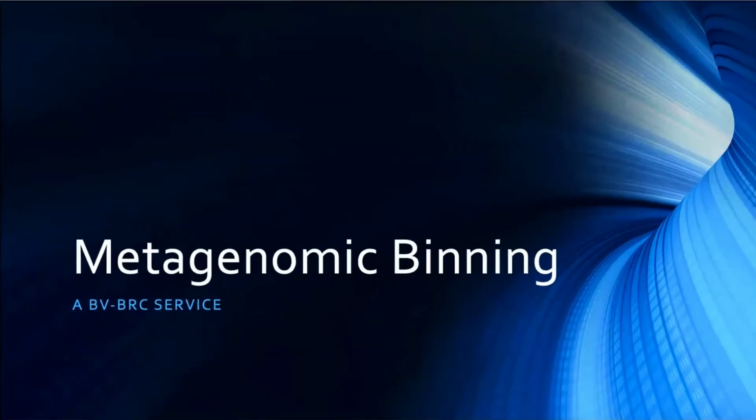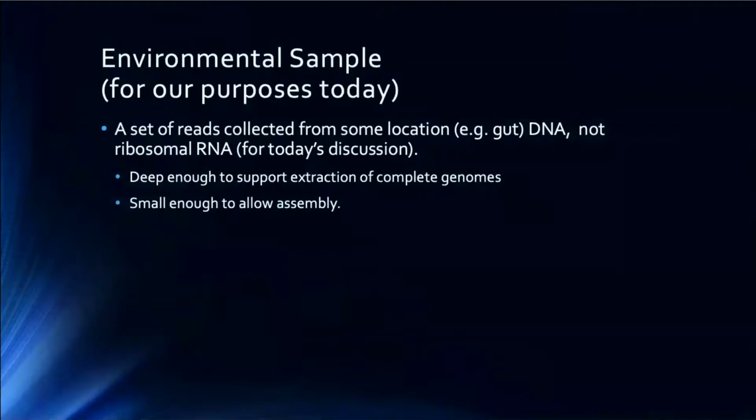All right, so we're going to talk about metagenomic binning, which is another service in BV-BRC. For the purpose of what we do with the binning in BV-BRC, it's been targeted at environmental samples, in large part because that's where the folks who are doing this, where their interests lay. And the intent initially for this service was to use environmental samples to extend the set of genomes that we know about by extracting high quality, fairly complete genomes from samples.